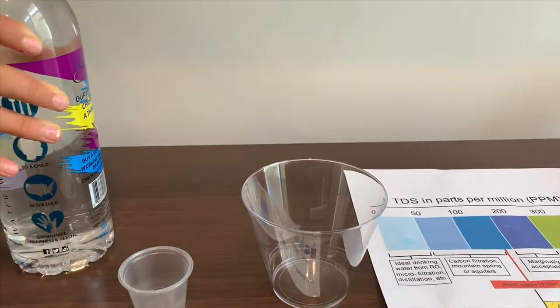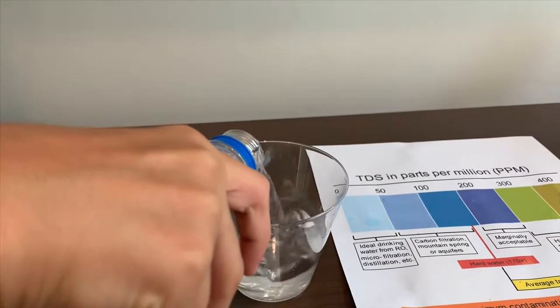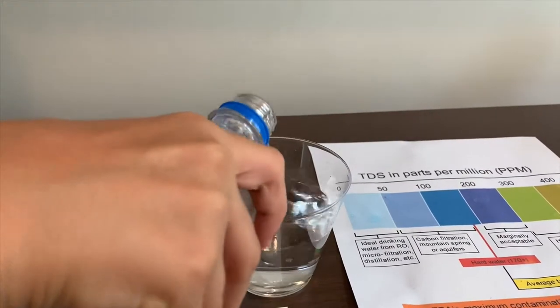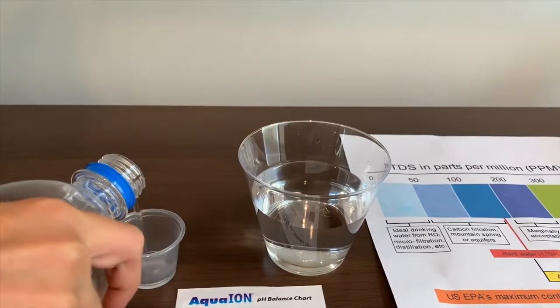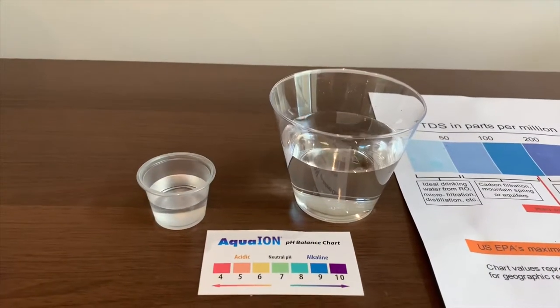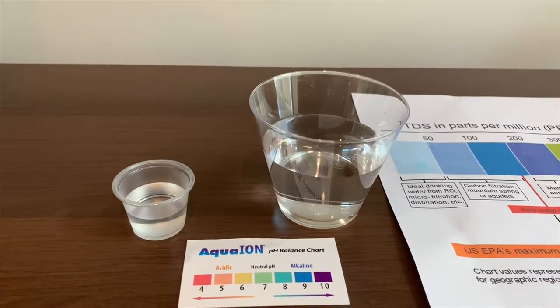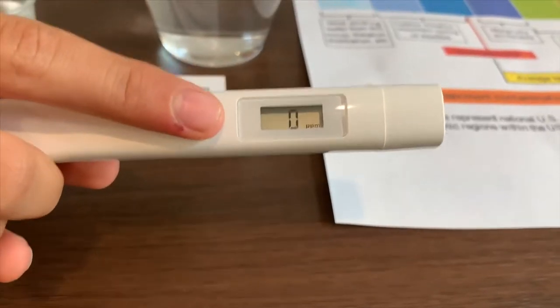First we're going to test the TDS level, then we're going to test the pH. Turn on the TDS tester.